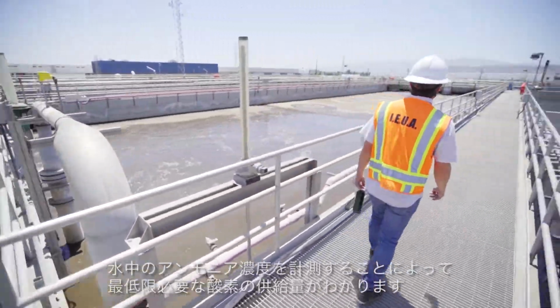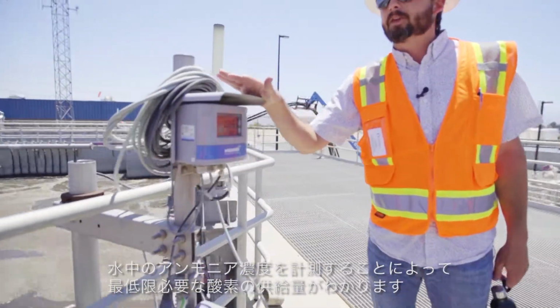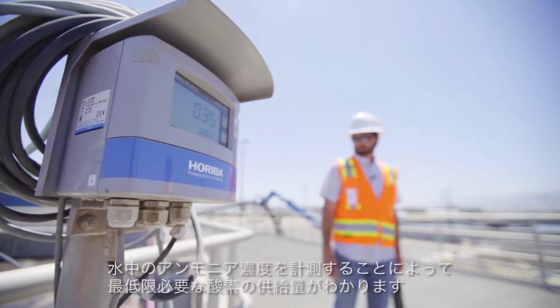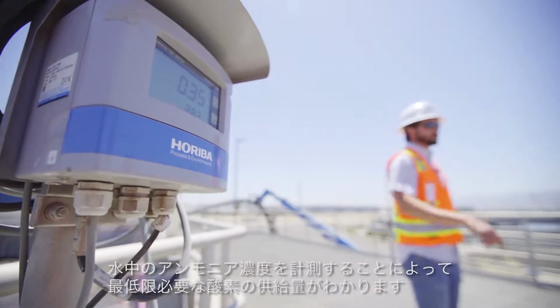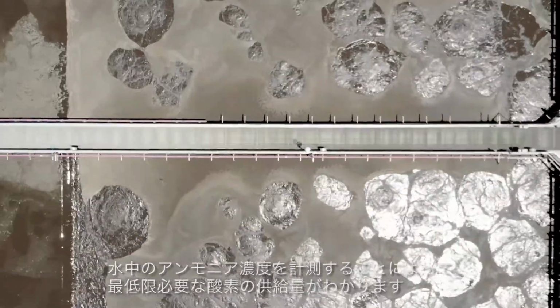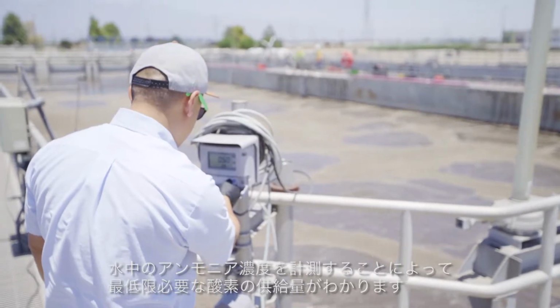We have now been transitioning more to using nutrient-based control of our aeration blowers. So in order to predict the blower demand, we want to use ammonia probes to predict what an oxygen demand would be, in theory be able to ramp up the blowers when needed depending on ammonia demand rather than an arbitrary dissolved oxygen concentration in the aeration basin.